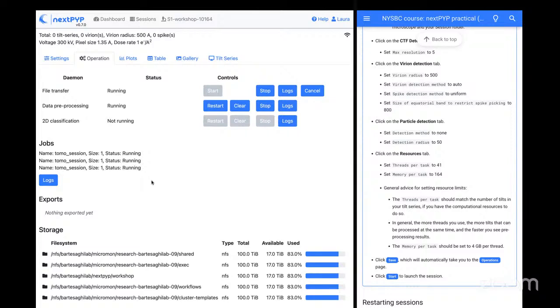Are you transferring from the microscope to another computer, or having that other computer pull it? No, we have a K3, so all the data is stored in the K3 server, and if it starts to transfer from the K3 to another storage, it affects the speed of the data collection, because we're using the same disk to store the images from the camera while it's transferring from that same disk to another one.